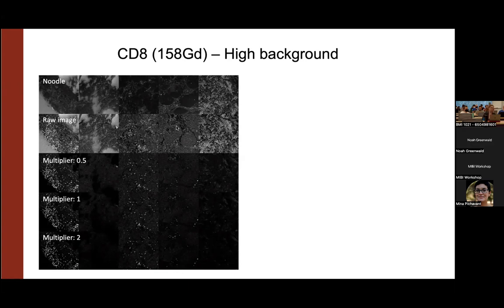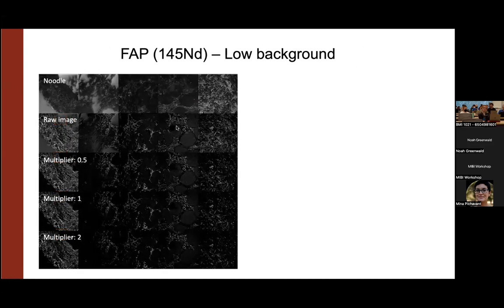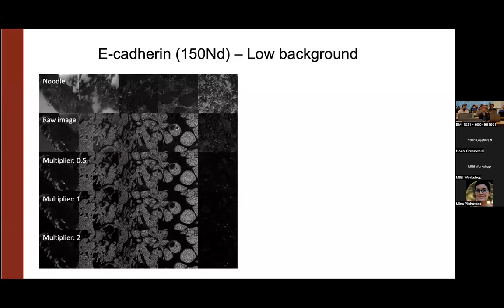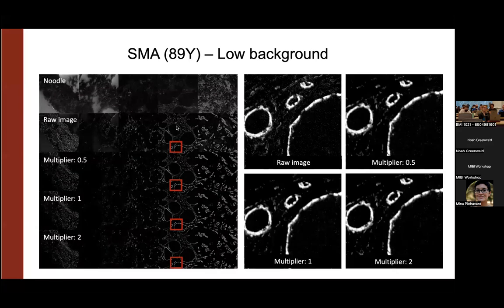That's what should guide what the weight needs to be, because the signal intensity on brighter channels is a lot higher, and in some cases those might not even need any cleanup because the signals are so bright. So you really want to make your decision based on what's needed for the weaker signals. And that should get you to the right place.